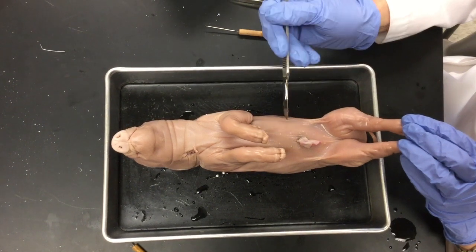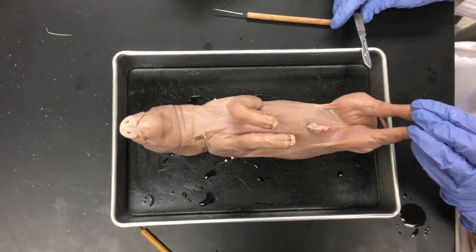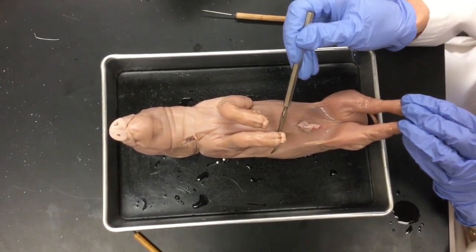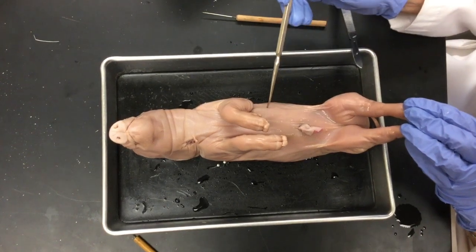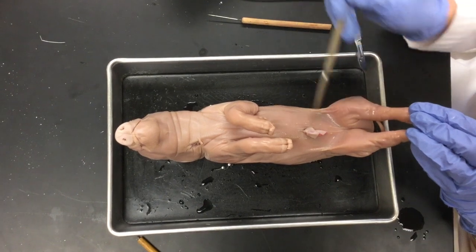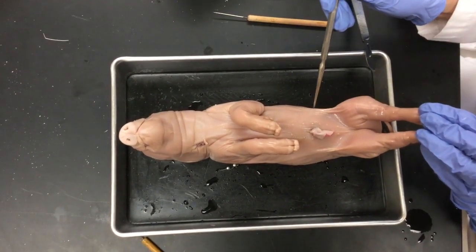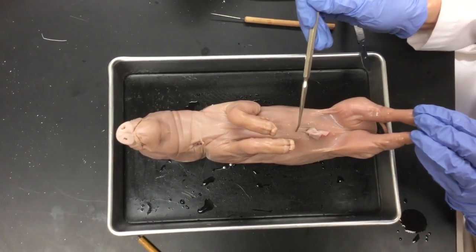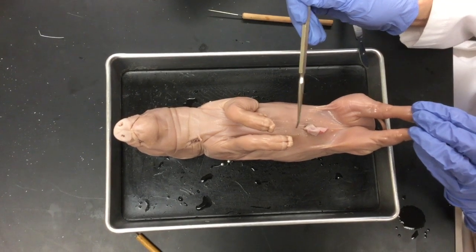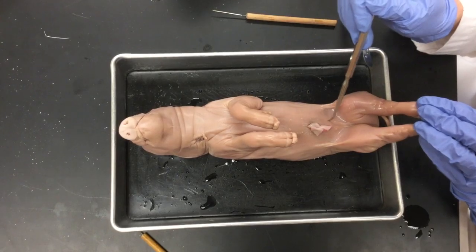Today we're going to open up the abdominal cavity by making a few cuts. We're going to cut right up close to the mammary papilla, making a circular cut in that direction, and another one down below the umbilical cord towards the legs. We'll also make a cut down the midline above the umbilical cord and a key-shaped cut around the umbilical cord.